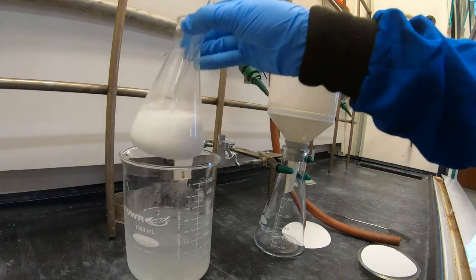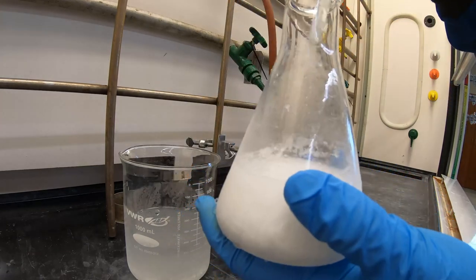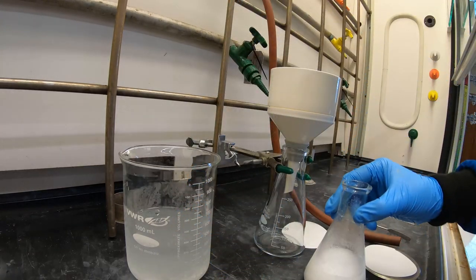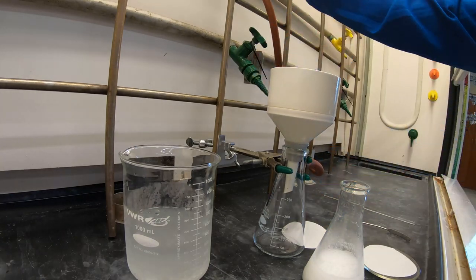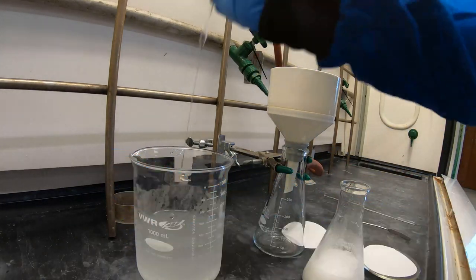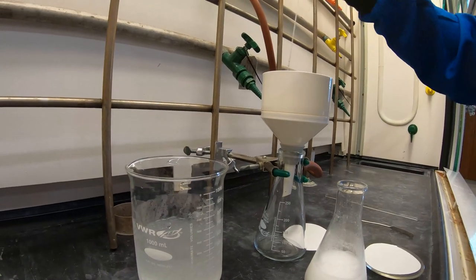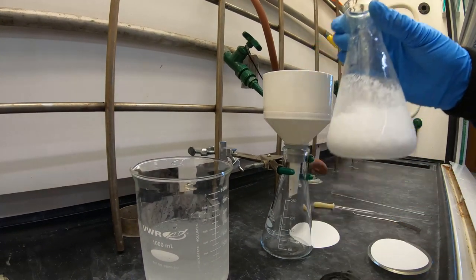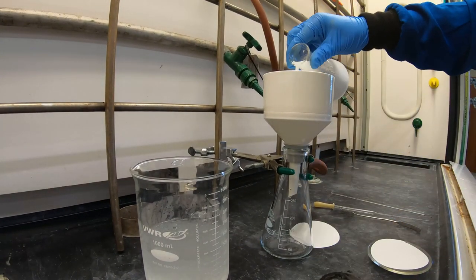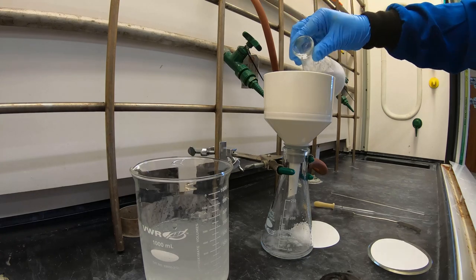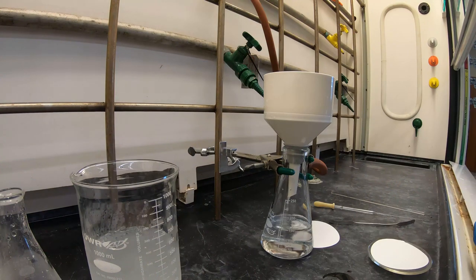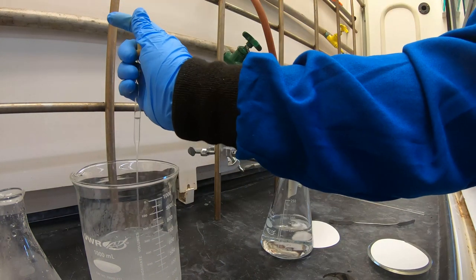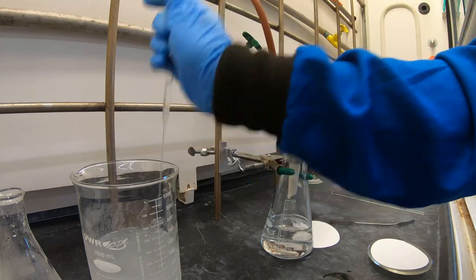While you're waiting on your product to chill in the ice water bath, set up your vacuum filtration apparatus. Then dampen your filter paper using a small amount of cold water. Begin to filter your product, swirling the flask as you go so that you collect as much product as possible. Then rinse the solid using a small amount of cold water to remove any remaining acid.